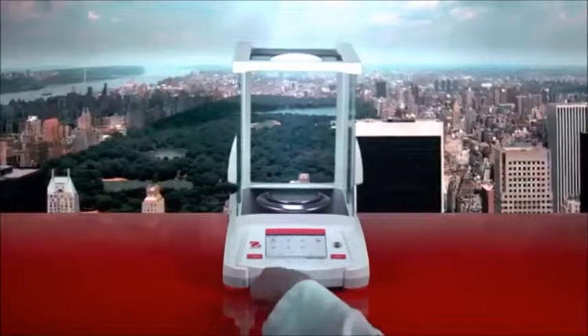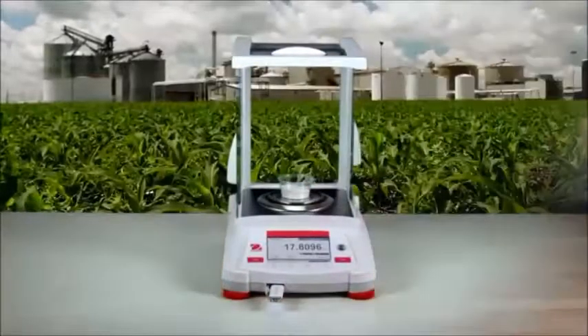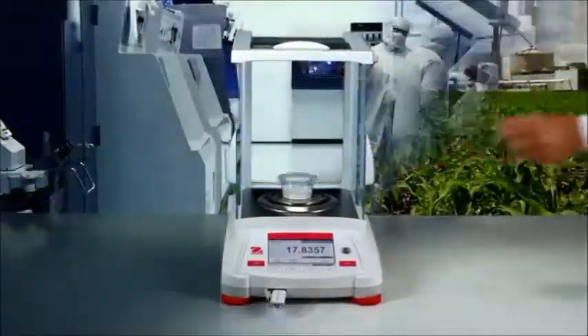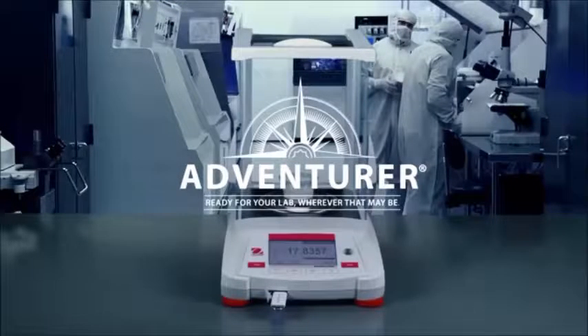A front USB port, a space-saving draft shield, and industry-leading performance. The all-new Adventurer — ready for your lab wherever that may be.